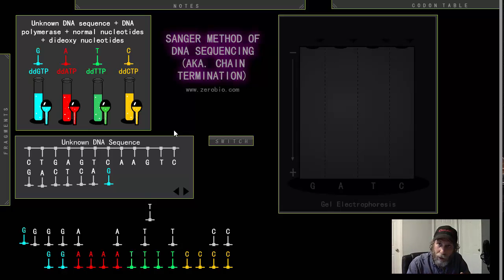And if you know about gel electrophoresis, if perhaps you've done something on restriction enzymes or DNA fingerprinting, you know that gel electrophoresis can separate DNA based on the fragment size, all the way down to 1 base pair difference. I'll show you that in a minute. So in this test tube, we also have this variety. And that's about it for this.